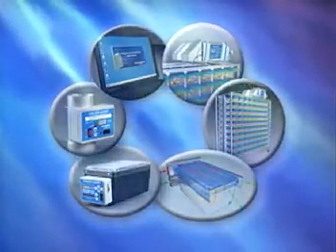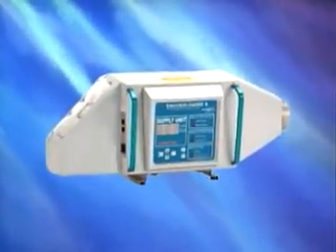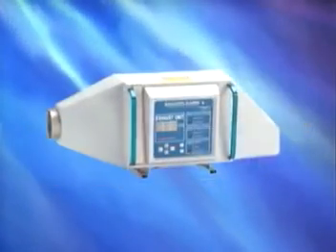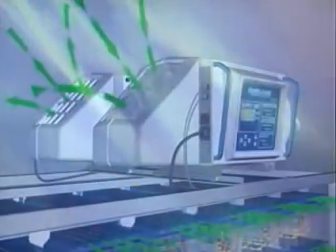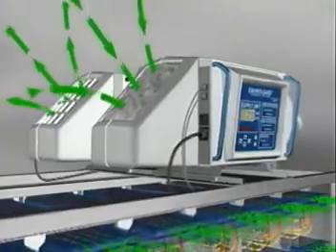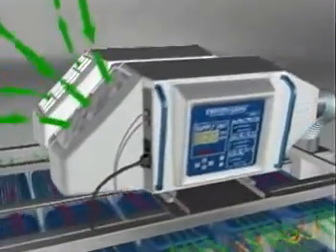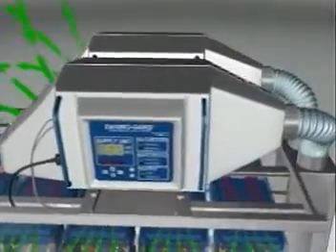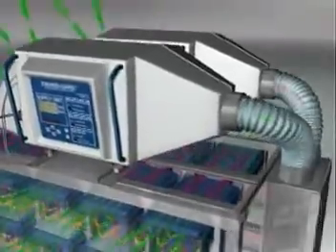These include EnviroGuard A HEPA filtered air supply and exhaust units. They combine microprocessor and volumetric airflow sensor technology to maintain constant preset airflow rates. Even as a HEPA filter is loaded with particulate, fan speed is automatically adjusted to compensate.